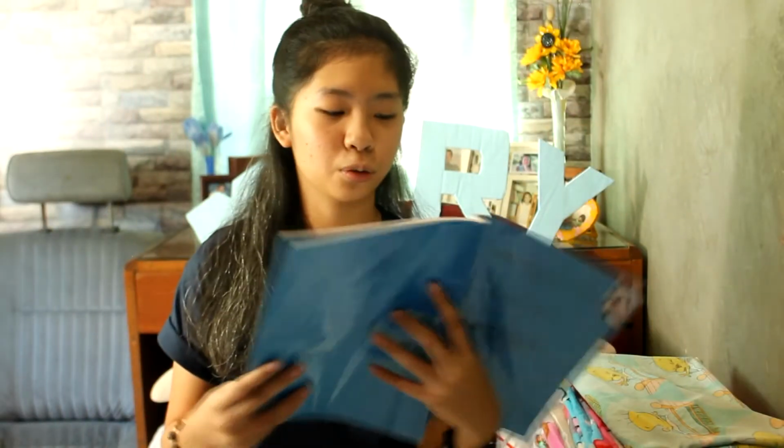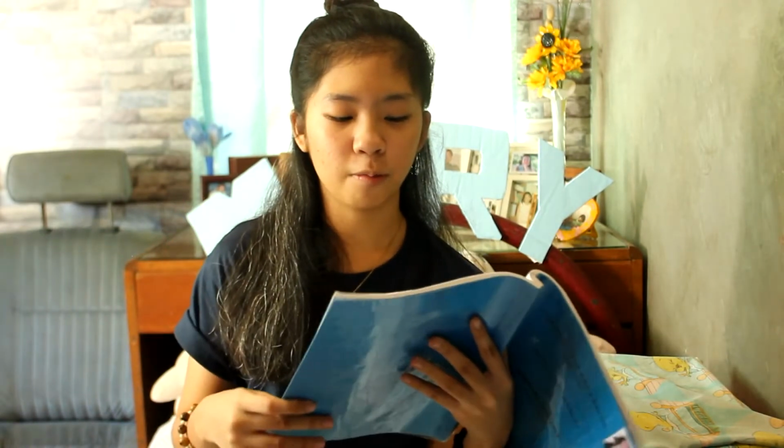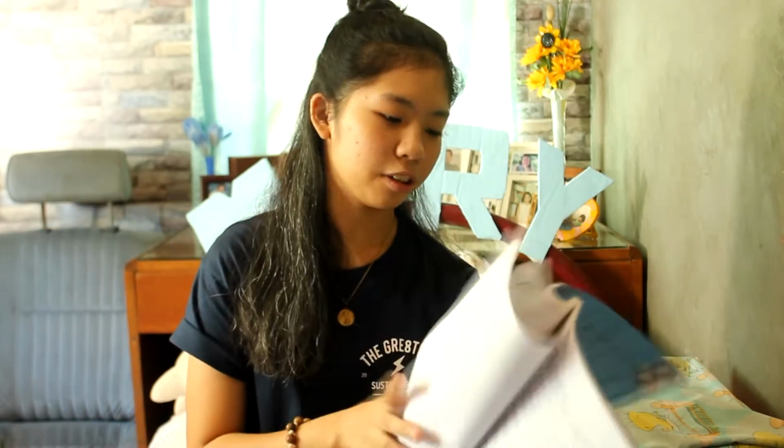Okay, so now let's go to the experiments sa external anatomy of frogs and toads. So first is to get a preserved frog from the stockroom counter. Additionally, allow the laboratory personnel or the instructor to euthanize the live toad. So since wala man tayo, it's sad. But from the previous experiment, we were allowed to see the difference of the frog and the toad. So, bali, mao na siya ang picture.